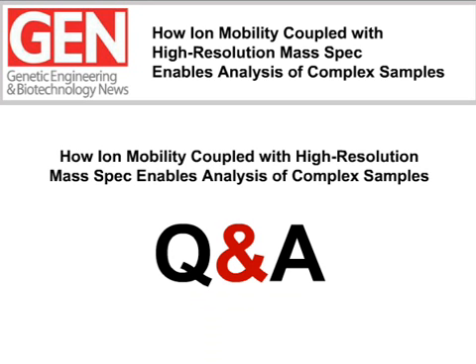Thank you, George. Aaron, a question for you: how was the quantification done? So the quantification was done in that experiment at the peptide level, and so we looked at statistically significant peptides to see if they were changing, and then the ones that were changing, we rolled them up to the protein level and then did a protein-to-protein comparison.